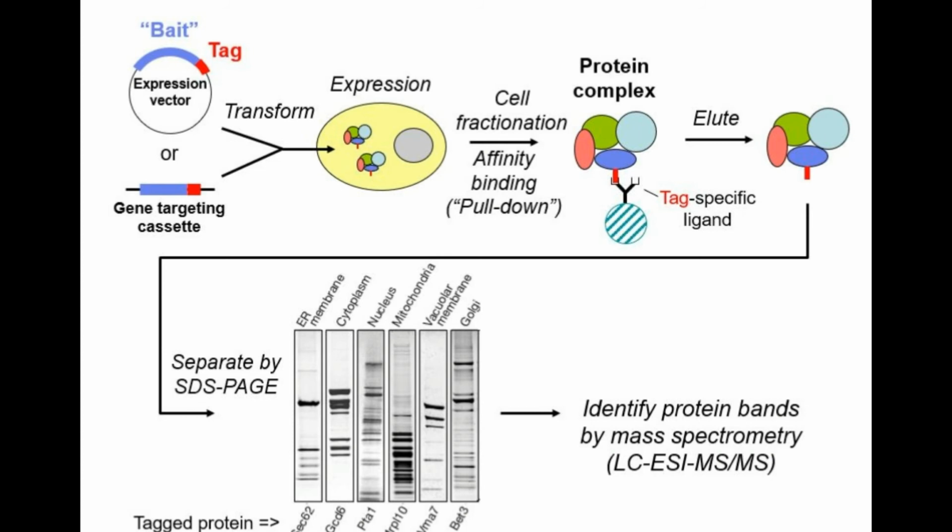This can occur on nanobeads that have exposed antibodies for certain protein targets. So it will help us to pull down, or attract, all the necessary proteins towards the nanobeads. And then we can elute the system out using magnets, because nanobeads are magnetic in nature. And we can perform an SDS-PAGE on the products of our eluate, so we can see the proteins that are present.